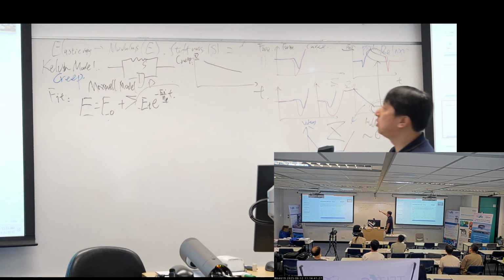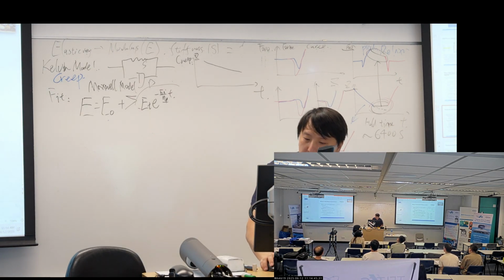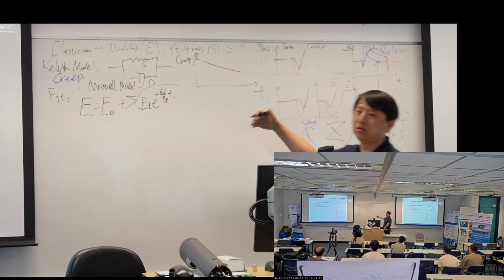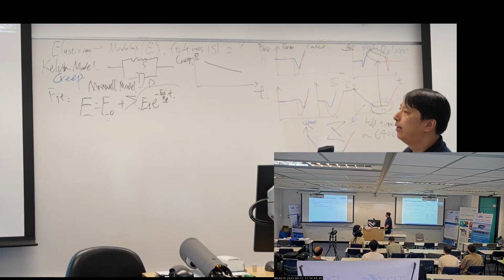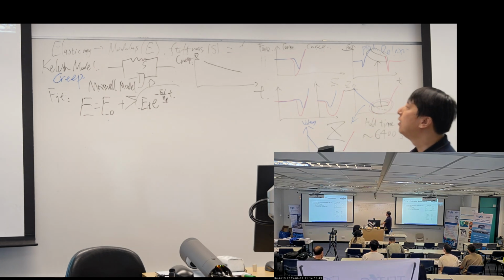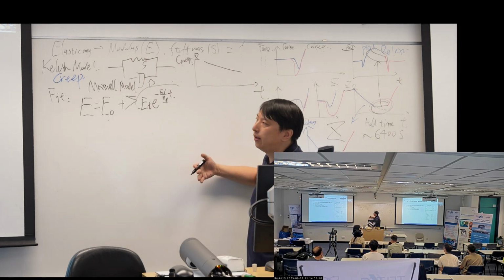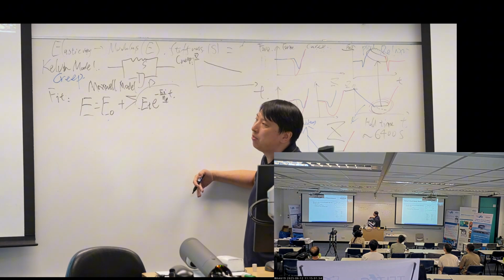It's not the Z. So we need to do some data processing here. First, it is Z, not the deformation.